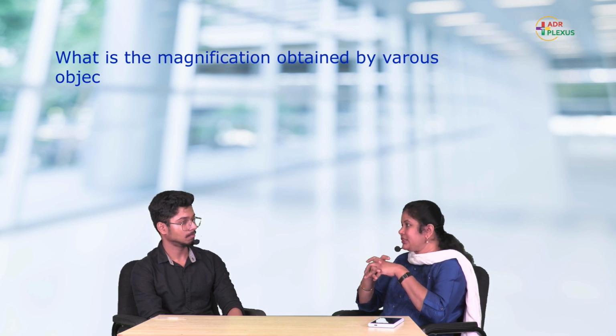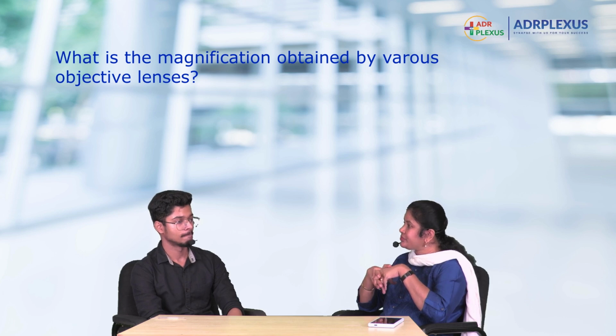Now that we have different types of lenses, can you tell me the total magnification by each lens? For 10x, it is 100. How 100? It is only 10 times magnification, right? The eyepiece has 10x, ma'am, and the objective lens also has 10x. So 10x and 10x gives 100x, ma'am. Very good. Similarly, for high power we have 400x, ma'am.